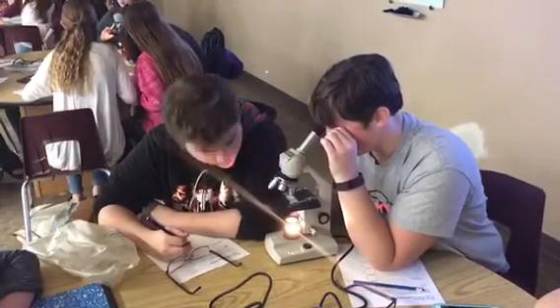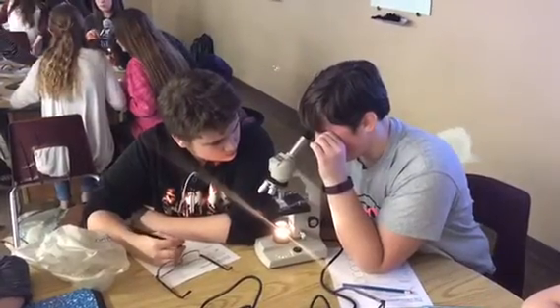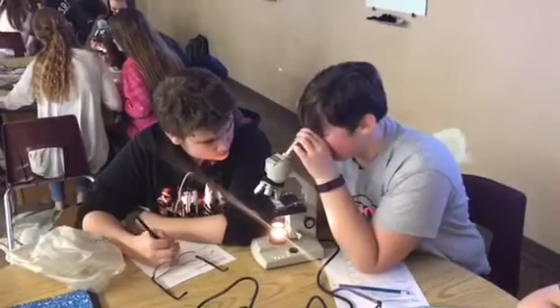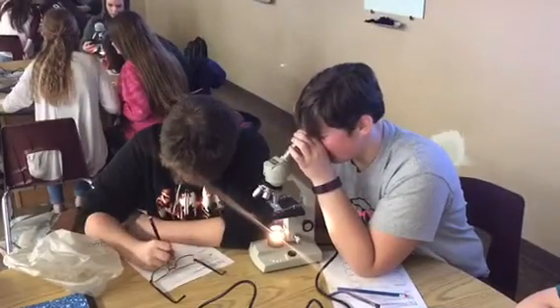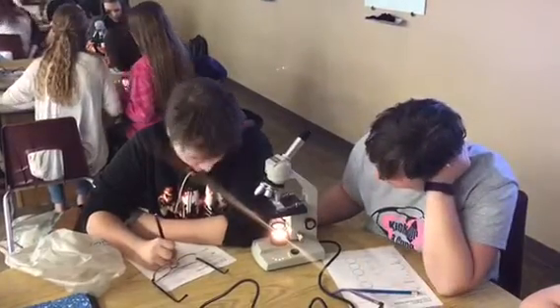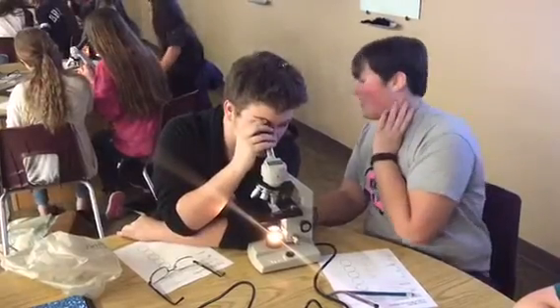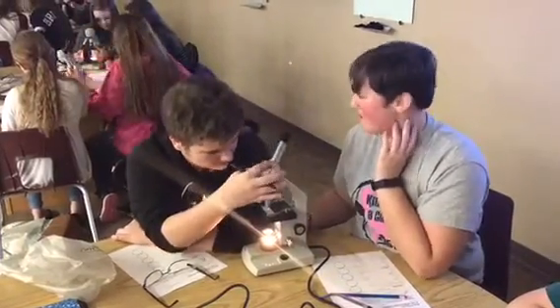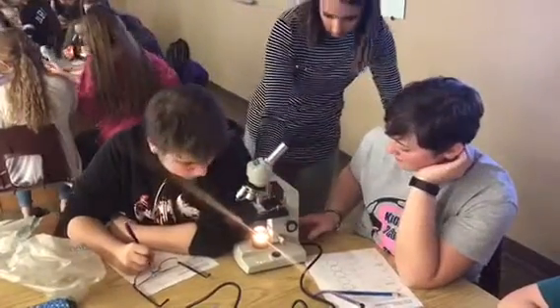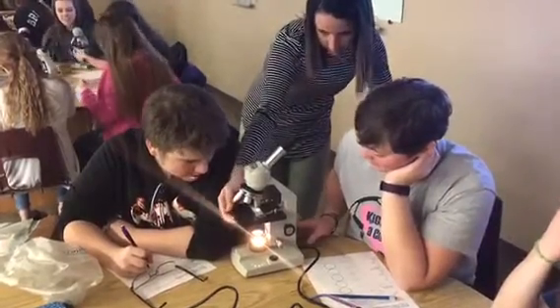If some of you are having trouble, if you're not getting enough light through, there is a little iris diaphragm that if you spin it, it makes more light through the viewing area. It's underneath, see, it slides. It lets more light in. It rotates, so it lets more light in, less light. Oh, so that would help a lot.